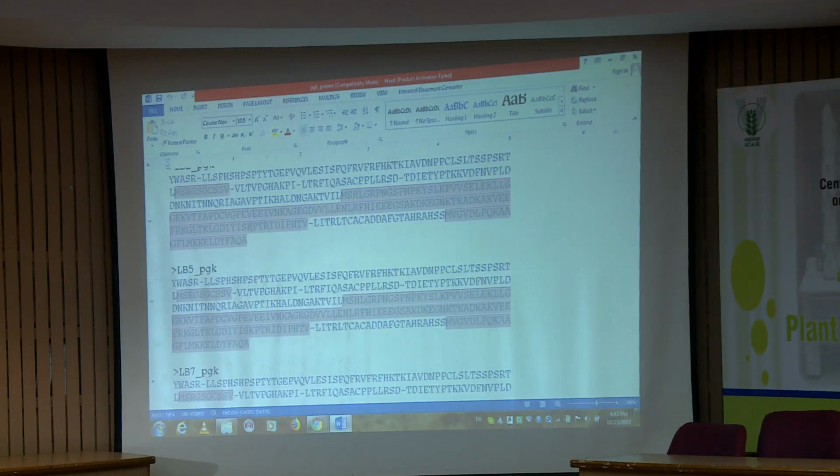Now, you have two things in your hand, one is the nucleotide file and another is this protein file. Now, we will start with how to make the flat file. For this, Sequin is one of the versions that is in NCBI only. Download that Sequin, which you can also use later offline.